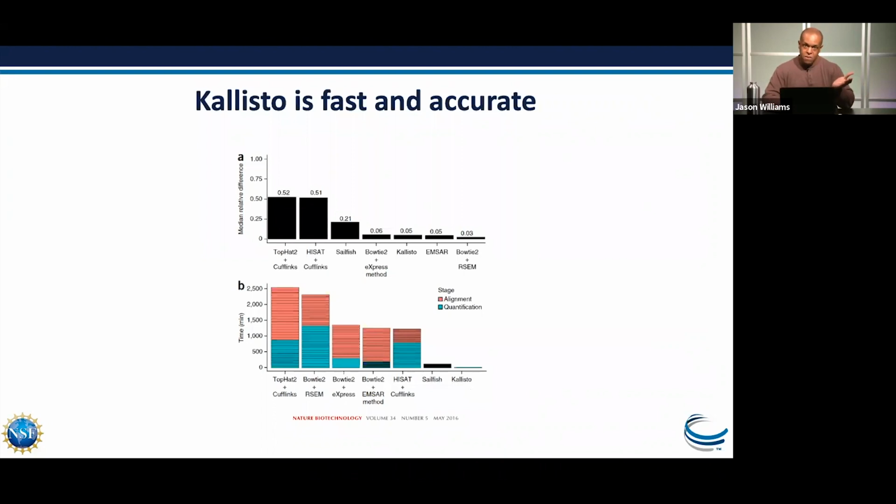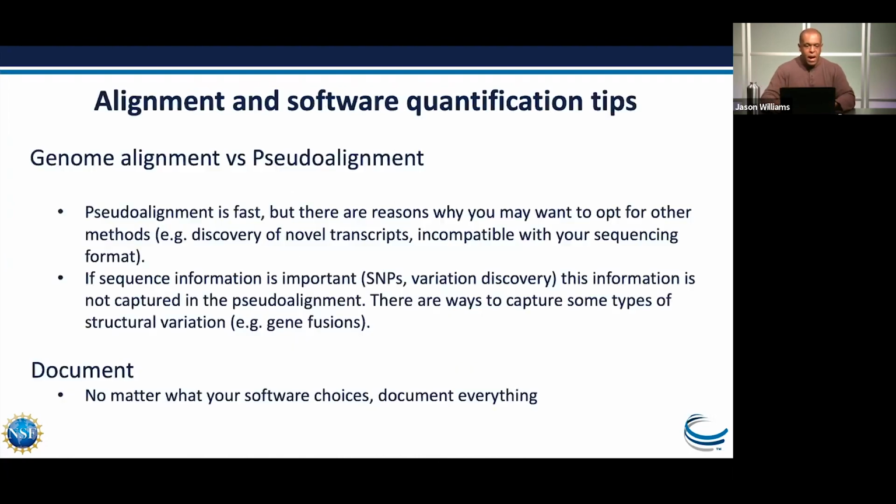So from FASTQ files all the way to some analysis, which makes it a lot more tractable for the classroom. I'm sure there will be bigger data sets and exceptions to that sort of hour rule, but for those of you who may have used the Greenline in the past, you may be familiar that sometimes it could take days. Most of that time was actually spent waiting for HPC. And there's another speed up that I'll talk about, which is relevant to how we got here today.